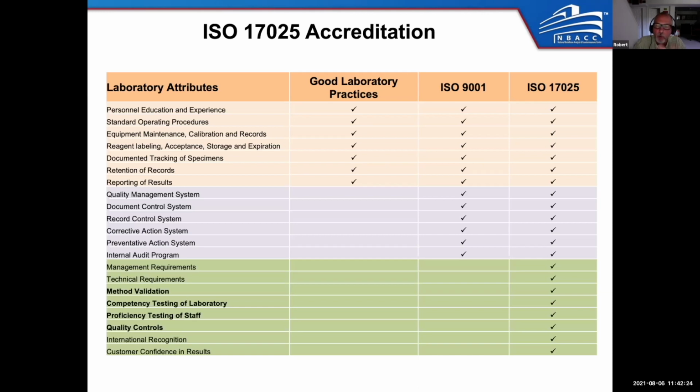And we have to quantitate something to prove the software is actually interpreting what the detector is providing, that it's working properly. So what we do is we use a NIST stainless steel, and we look at the amount of manganese inside the stainless steel to prove that the detector is interpreting the sample properly. All these standards that we use for quality control have to be either NIST produced or NIST accredited. And if you don't know what NIST means, it's the National Institute of Standards and Technology. It's in Gaithersburg and other places in the country.